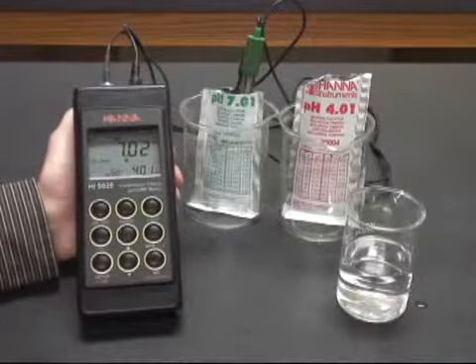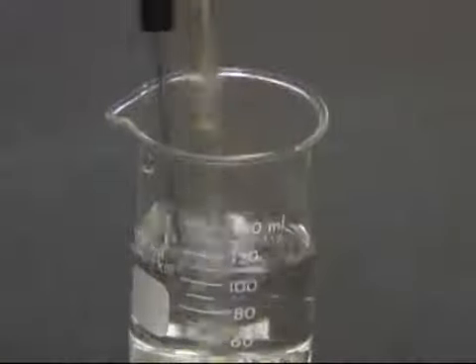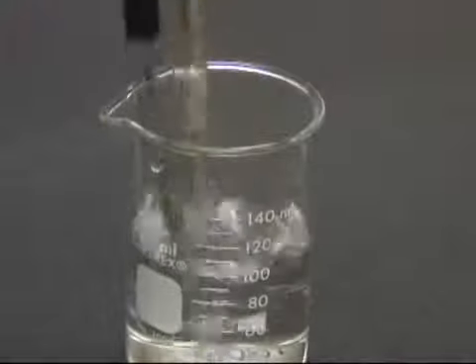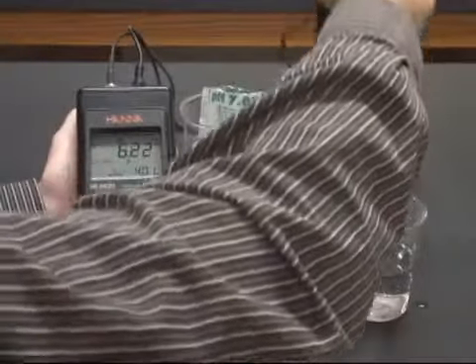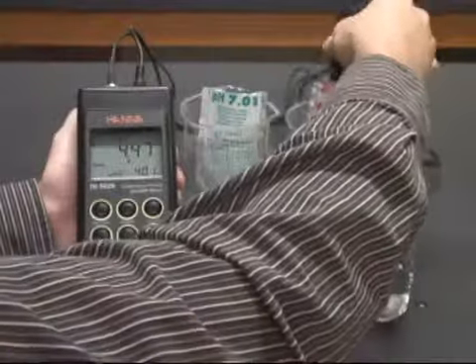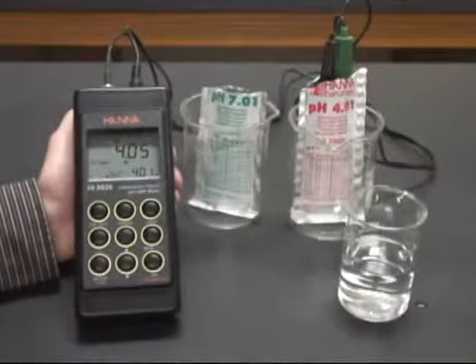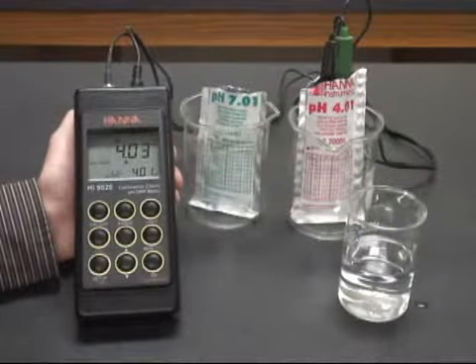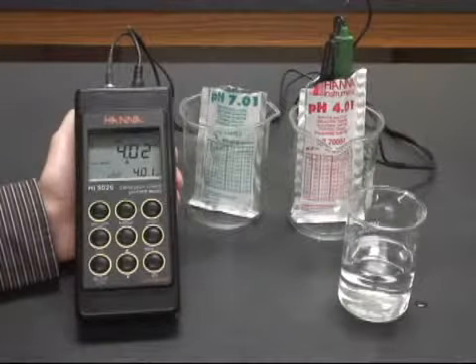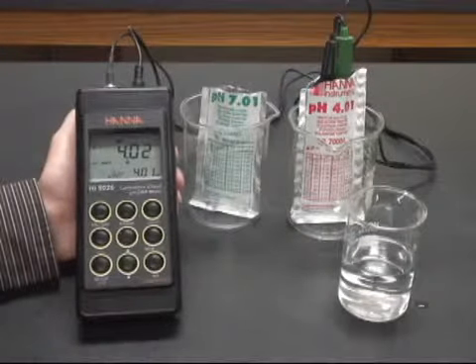You'll notice it asks you for the 4.01 buffer. You're going to take your probes, ideally rinse them very quickly in some DI water, and then put them in your 4 buffer, again mixing them a little bit to get out any air pockets. You'll see the procedure repeat as it asks you to confirm the 4.01 buffer after just a few seconds.